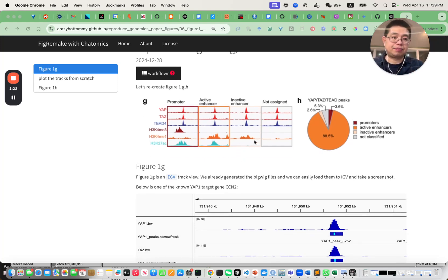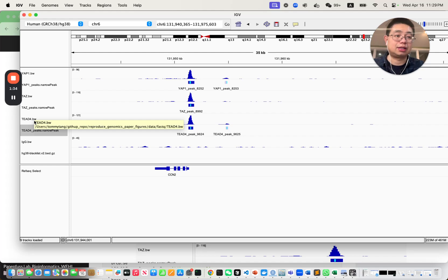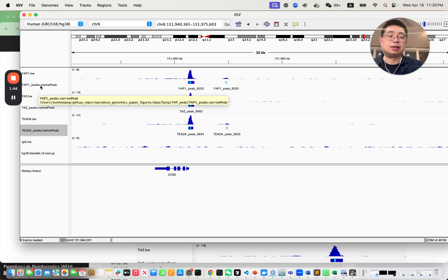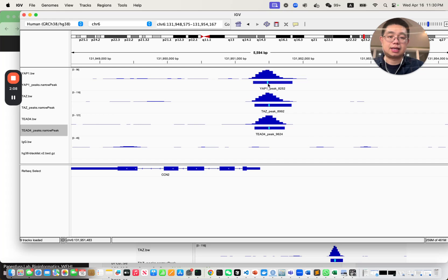For figure one G, as I said, this is just the IGV track view. I already loaded the bigwig files for YAP, TAZ, and TEAD4 — those are the raw signal files we generated in the previous video. I also added the peak files called by MACS3. As you can see, MACS3 correctly identified the enriched peak regions from the raw signals, like here in the CCN2 gene promoter. You can see in light blue the highest peak within that region — they call it the summit.